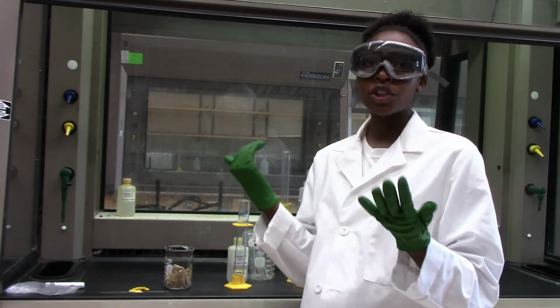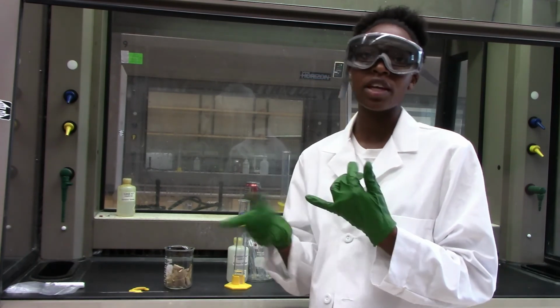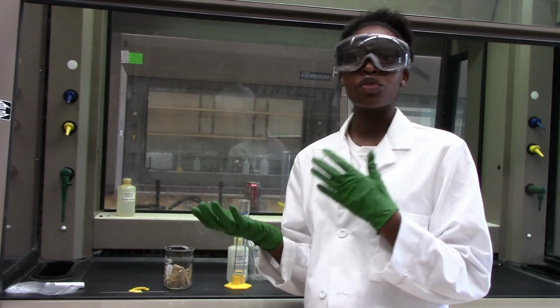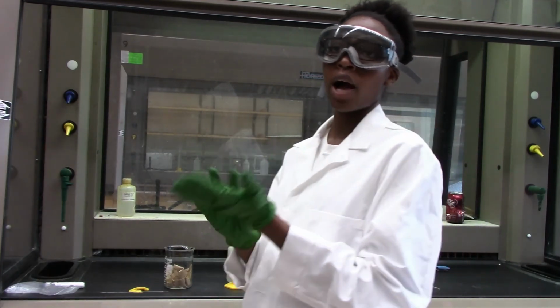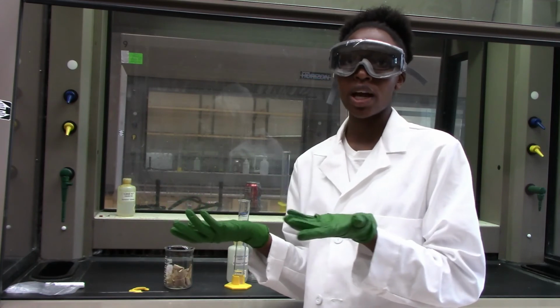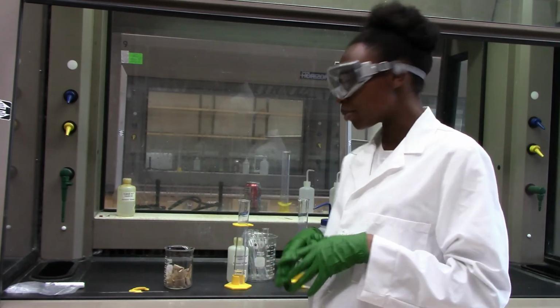So today we are using iron 3 ion, that's Fe3+, and thiocyanate ion to form a complex which will be our product of iron thiocyanate, and it will be +2. So this is a complex that will be formed here.